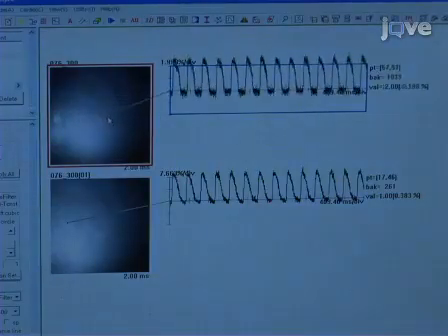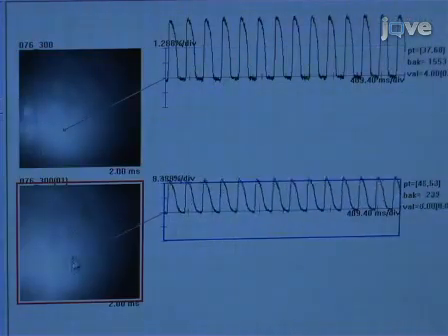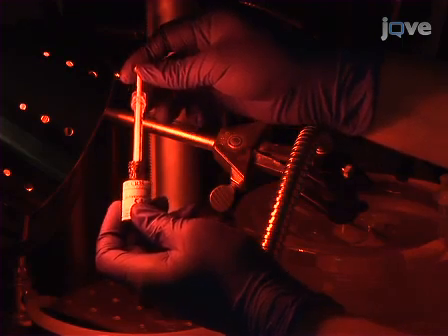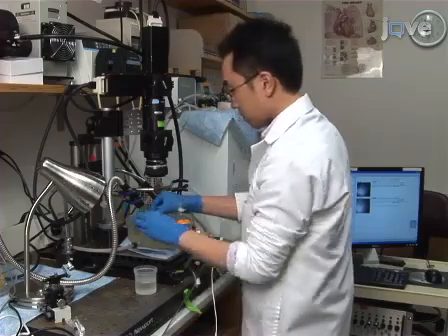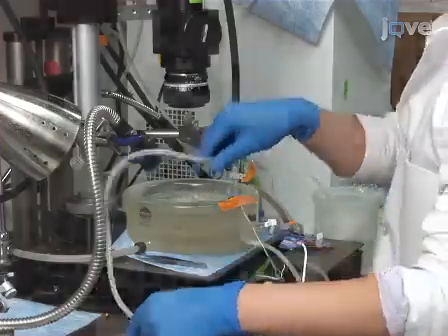If the signal is weak, restain the heart with additional RH237 and Rhod-2 AM. If there is motion artifact, add additional blebbistatin to remove the motion. With everything in order, proceed with the planned experiment and clean up the system when finished.